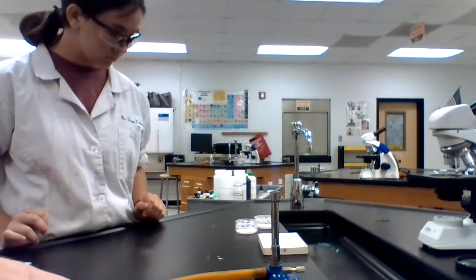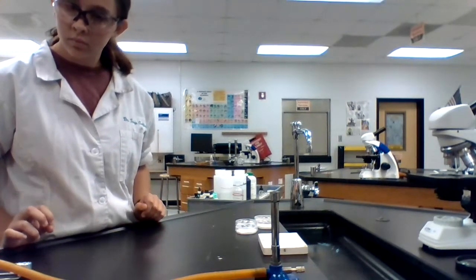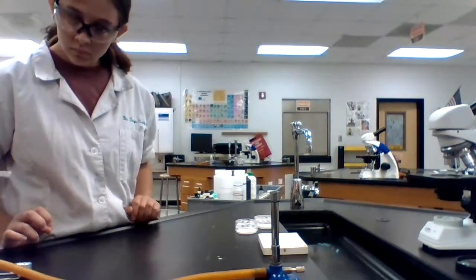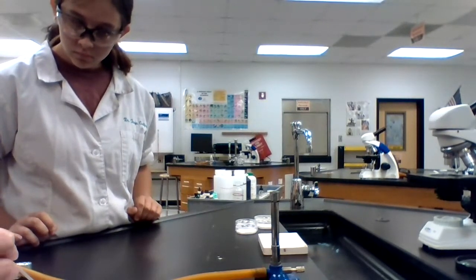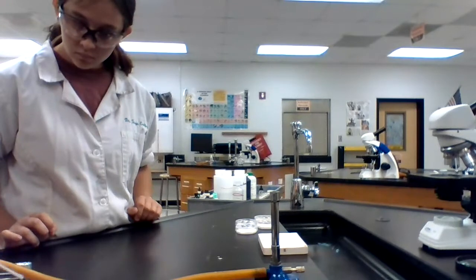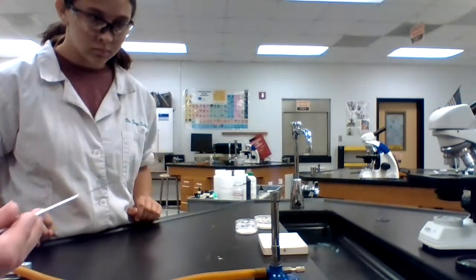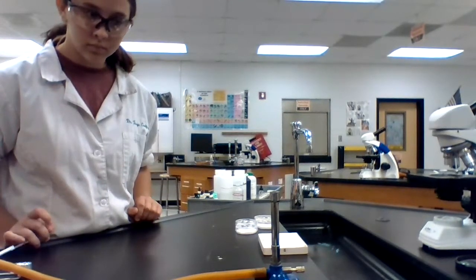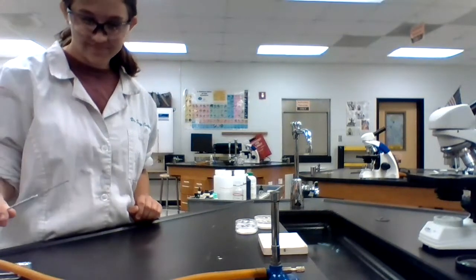So you're going to take this. I'm going to show you how to do it, and then you'll be able to do it because I'm going to keep the lights off in a minute. But what you'll do is you'll take just the loop, and you're going to put it into the well and mix it a little bit so that you have a little bit of something in there. And then you're going to put it into that middle blue cone and light the thing on fire. So I'm going to let you hold it, and let me turn out the lights.